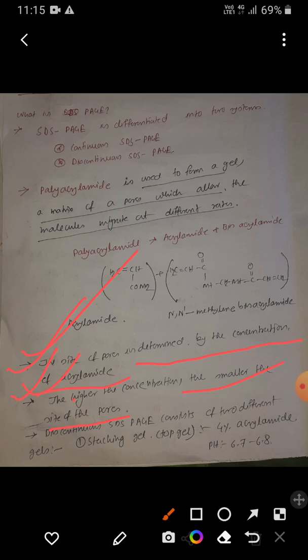So if you use a higher concentration of polyacrylamide, that affects the resolution of the gel, right? We have to keep in mind that the resolution of the gel is necessary. So what is this? Let's learn this with a very simple example.